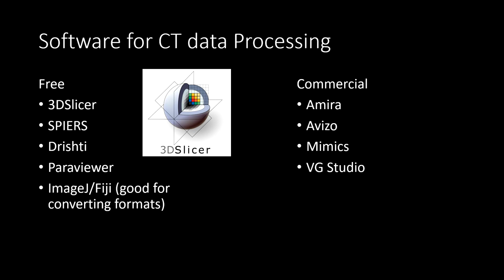On the commercial side, programs like Amira and Avizo are definitely going to be more user-friendly and maybe have a bit more functionality than this free software. However, they are extremely expensive, which is why I do recommend starting out on the free software.